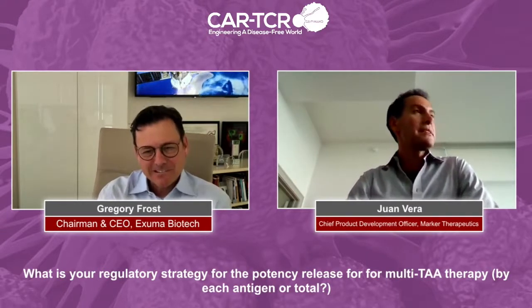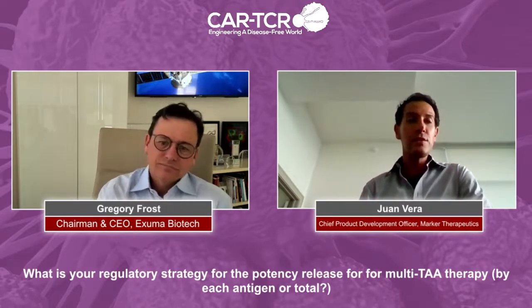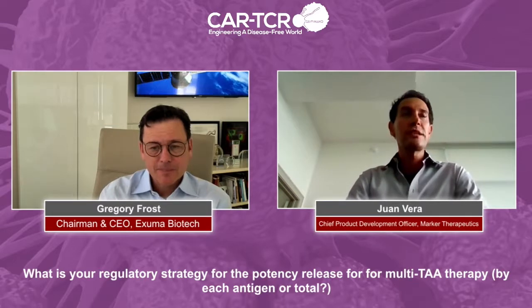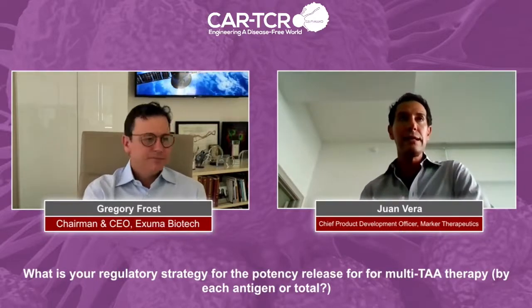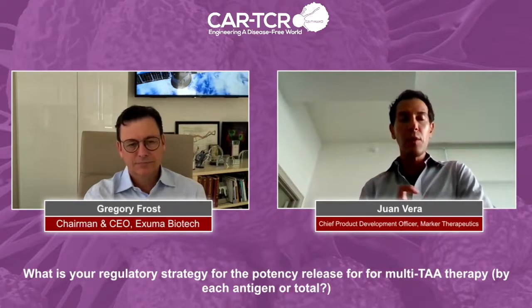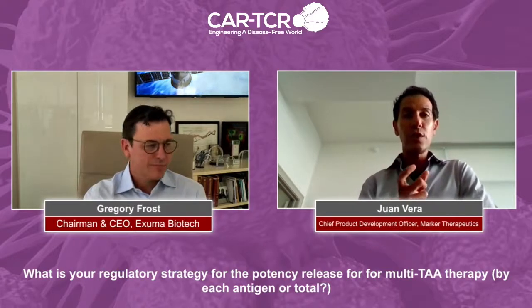Yes. Obviously, that is a field of high interest, particularly when you talk about a product such as this, a natural T-cell product that, due to the polyclonality and diversity, is sometimes harder to characterize, right? Now, we are using as a parallel the experience derived from virus-specific T-cells, which have been in the clinic far longer than tumor-specific cells, right? If we use that as a parallel, what we basically see is that a mechanism that has been accepted is the use of interferon gamma production. And what we have as an advantage is the use of a known source of stimulant, right?